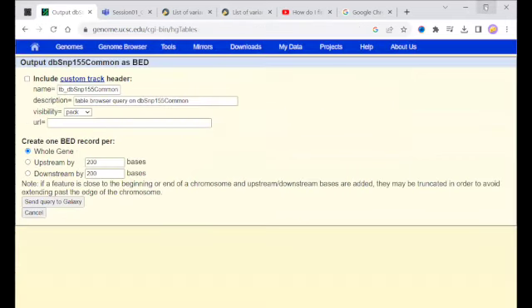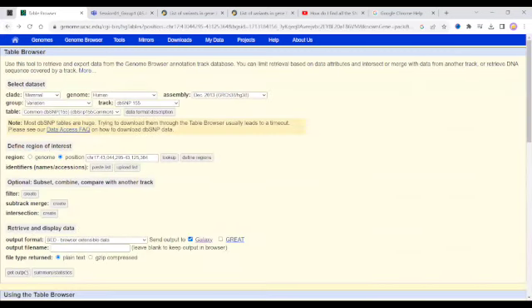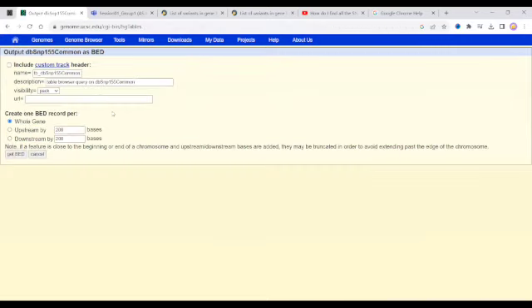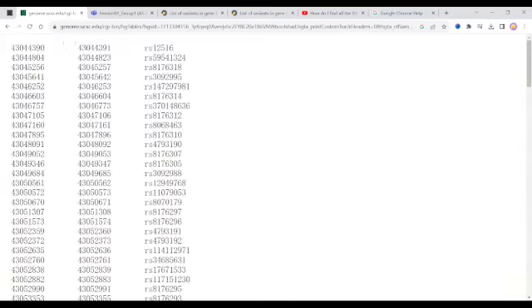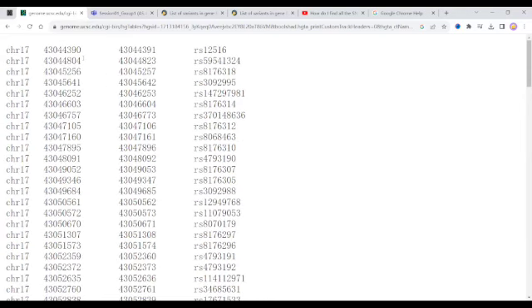Now, can you uncheck Galaxy again? Do not check mark Galaxy. Now get back. Can you magnify to show the first 5 or 10 lines? Good. This is what you got.